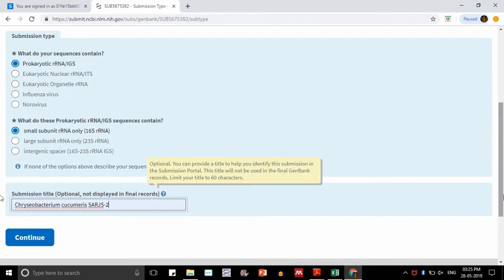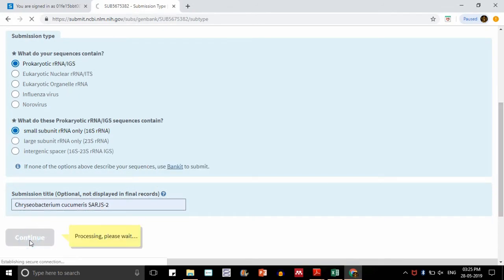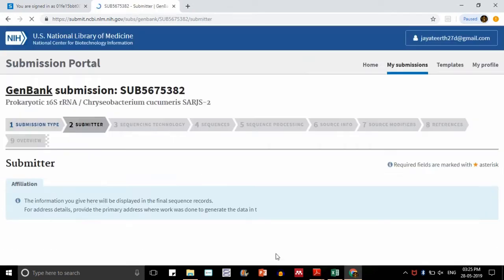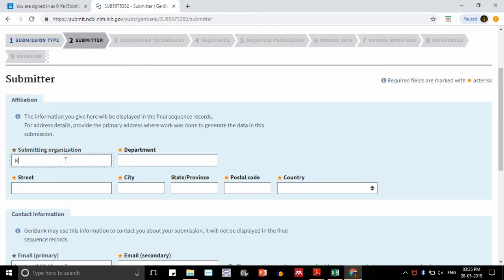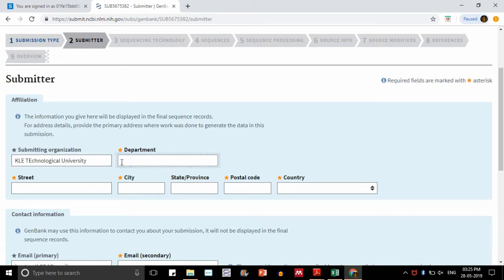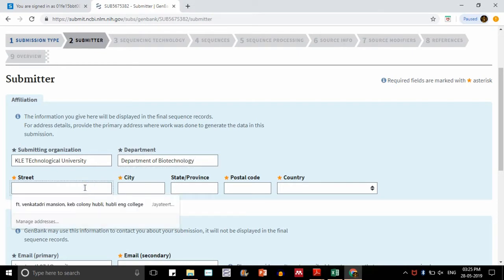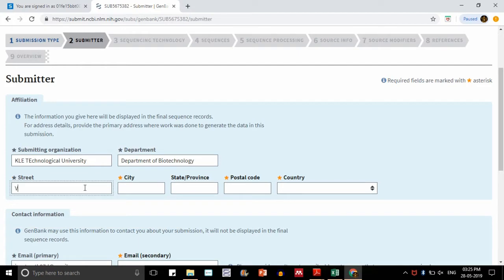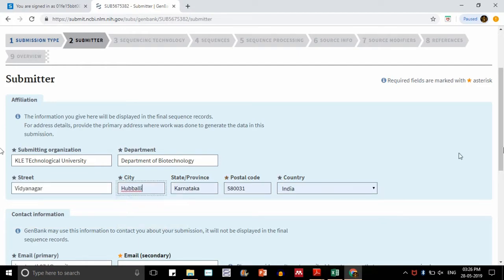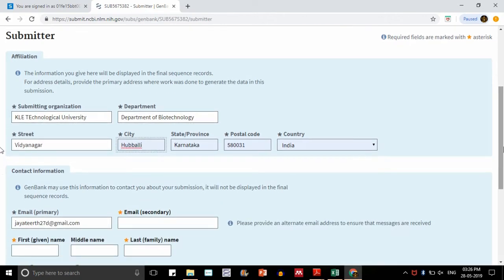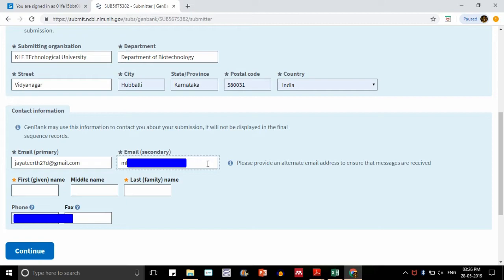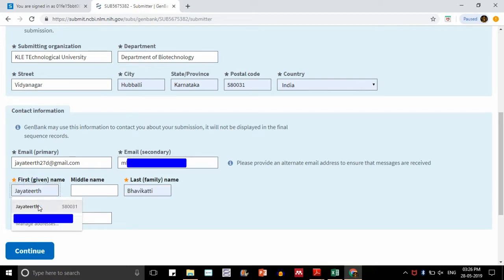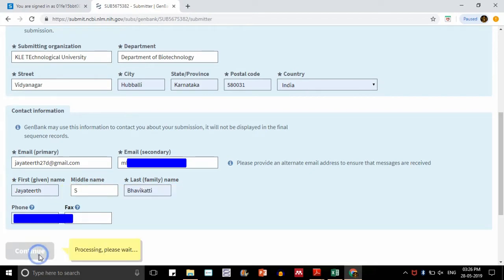This is my organism's name. Here is my sequence submitter, submitter affiliation. My submitting organization is so and so, I am just typing it down. It is asking for the organization, the department, and its complete address. You can just go on typing it and I will run through this till the completion gets over. Now we have contact information, so I am giving my primary email ID and also secondary email ID. First name, last name, middle name, everything will be given. We can even give phone number as well as fax numbers. Just say continue.